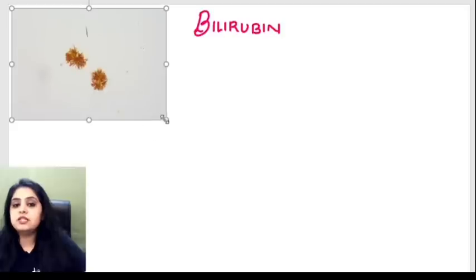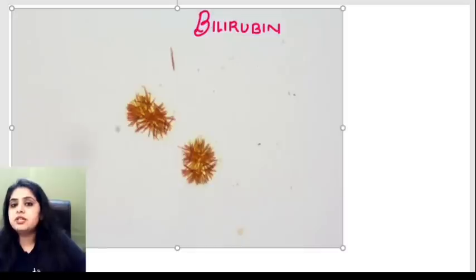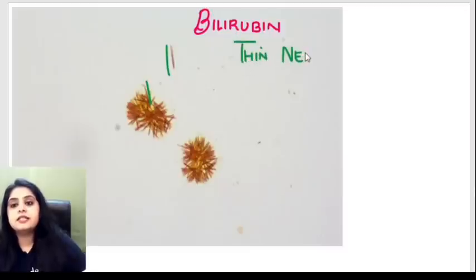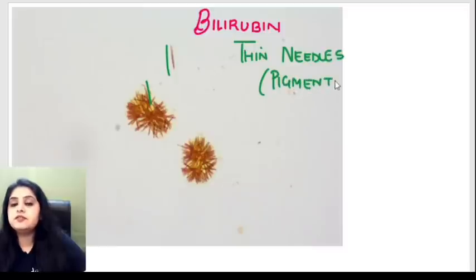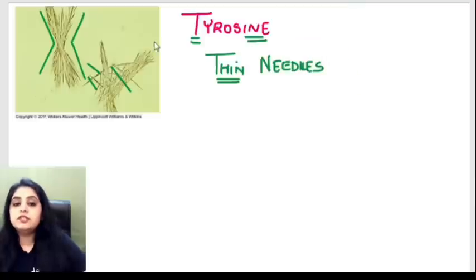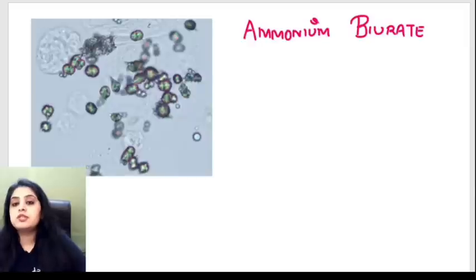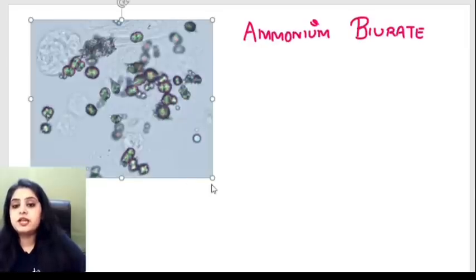The next image shows crystals that also look like a bunch of needles, similar to thin needles, but there's a difference: no stain was applied yet they have a color — they are pigmented. So if you have thin needles that are pigmented, you are dealing with bilirubin. Tyrosine sounds like 'thin' giving unpigmented thin needles; bilirubin also gives thin needles but they will be pigmented.